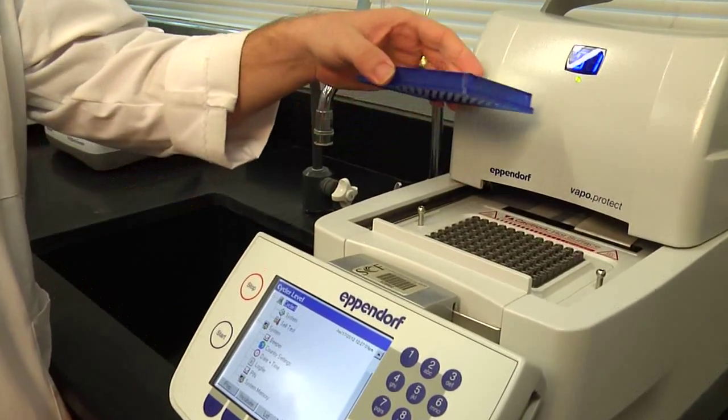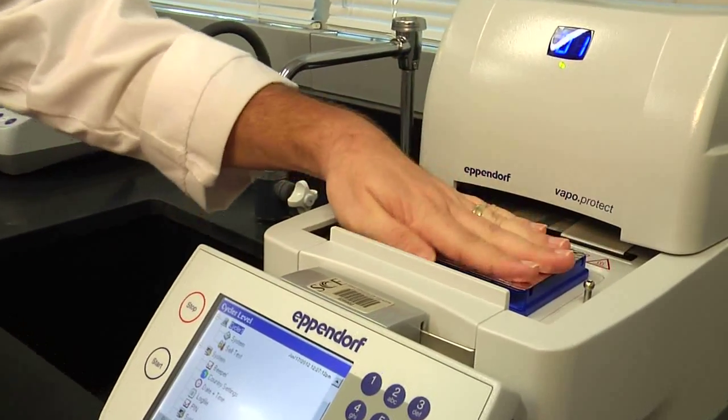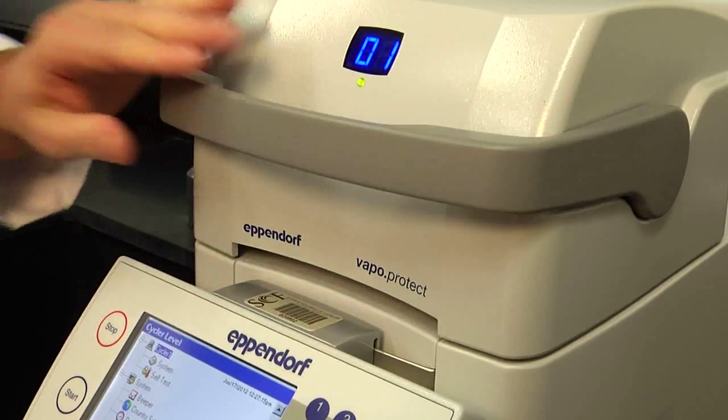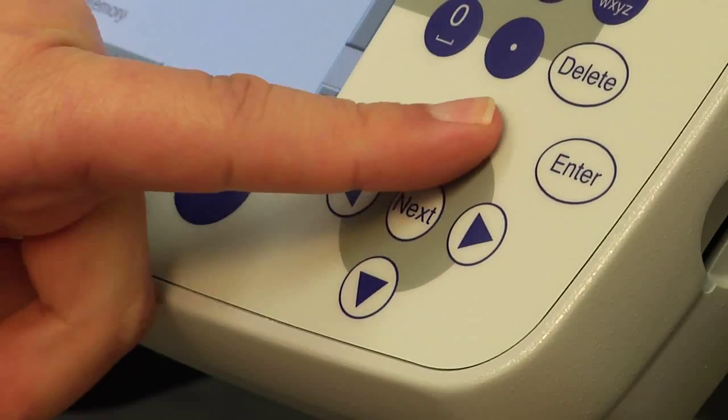It is a top-of-the-line instrument that has lots of capabilities, but really when it comes down to it, you simply prepare your samples, place them inside the instrument, close it up, and tell it what to do by hitting a few simple buttons to set how much you want to heat your sample and so forth.